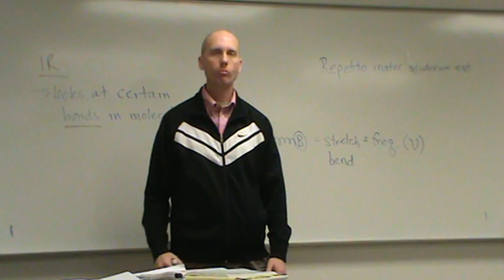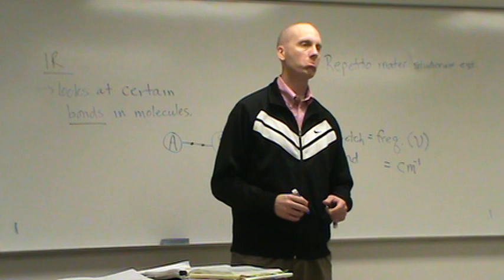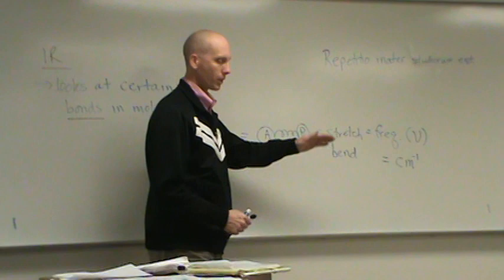and the particular units of the frequency will be cm to the minus 1, or how else could you state that? 1 over cm. Okay. Or more technically, you could call this reciprocal centimeters. Okay? That's what we want to start calling that, reciprocal centimeters. Okay? So all these have certain frequencies.